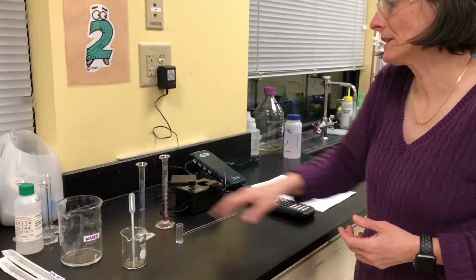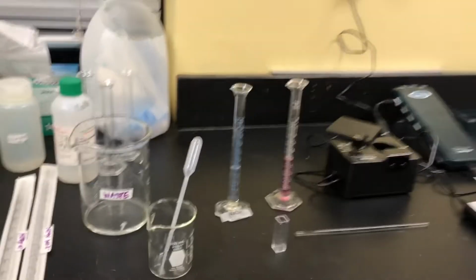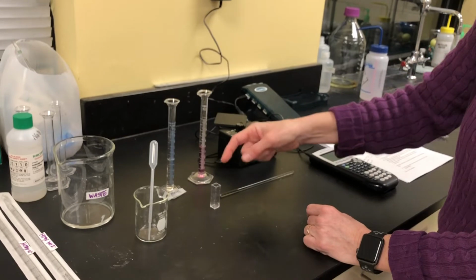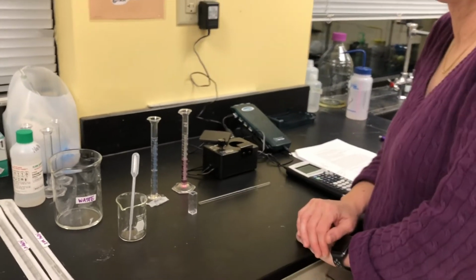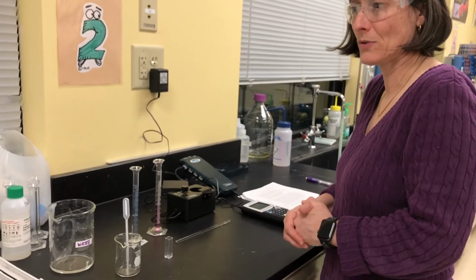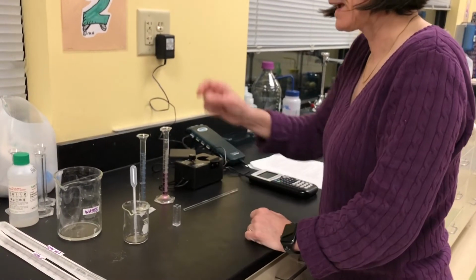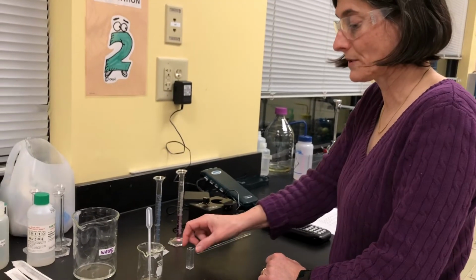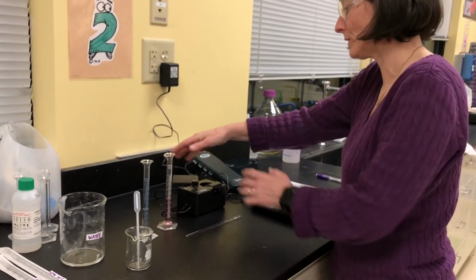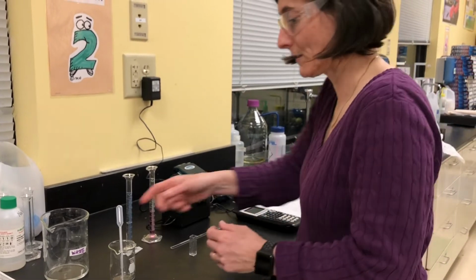Now just to explain what I'm going to do next, because I'm going to do it very quickly, I have 5 milliliter amounts of both the crystal violet and the 0.20 molar sodium hydroxide already pipetted out. I'm going to combine those in a beaker, mix them up quickly and swirl them with a pipette, and then I'm going to fill my cuvette about halfway with the mixture just to rinse out any residual deionized water and put it in the waste. So that's a process called conditioning, when you want to make sure that there's no residual chemicals or contaminants in your graduated cylinder or cuvette before you start your experiment. And then after I do that, I'm going to very quickly fill up my cuvette about 3/4 of the way with the crystal violet sodium hydroxide combination, put it back into my colorimeter, close it up, and then hit enter so that I can start collecting my data for the kinetics reaction. So that's what I'm going to do right now.